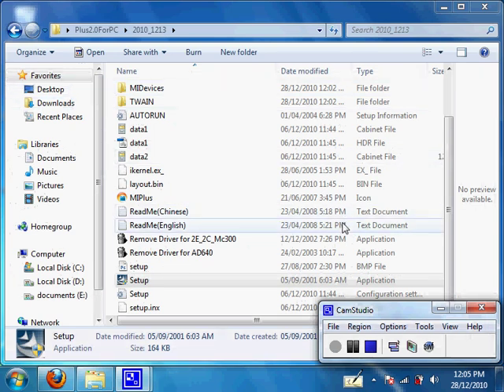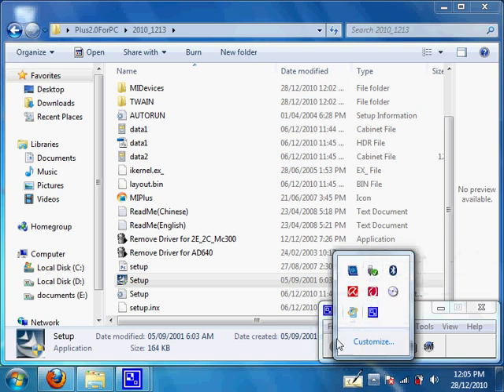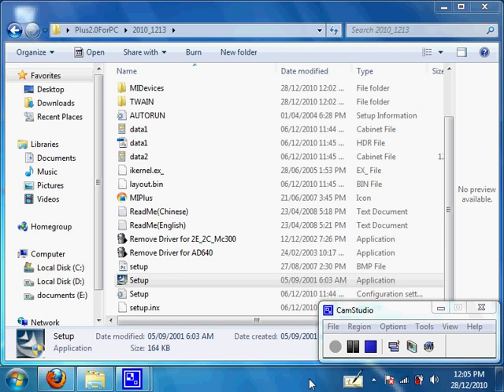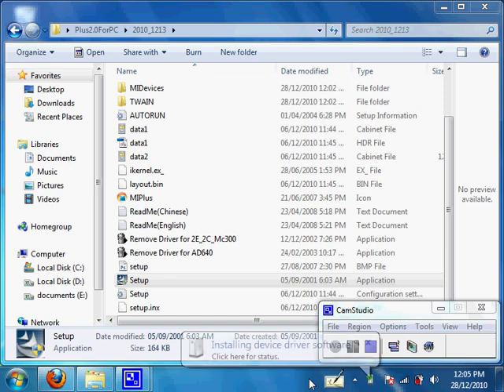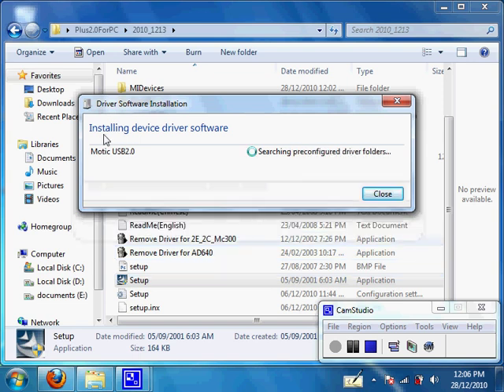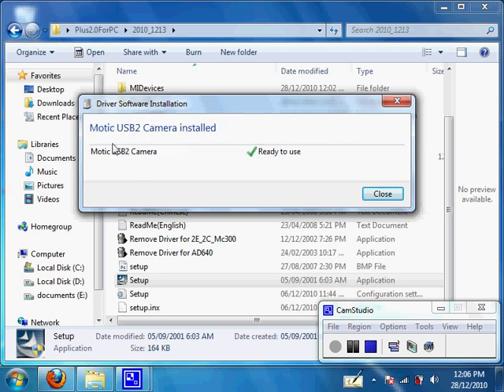Now plug in your Motic Cam or microscope USB cable to your computer and power up the microscope. If the driver installation doesn't pop up, try plugging into another USB port. As you can see, before the driver installs the device is called Motic USB 2.0, and after it's done it will say Motic USB 2 Camera and show ready to use.